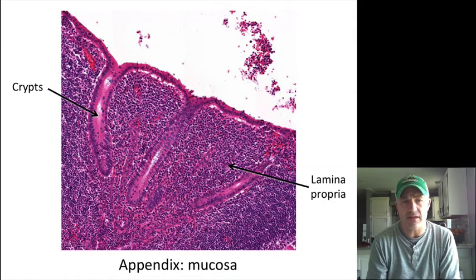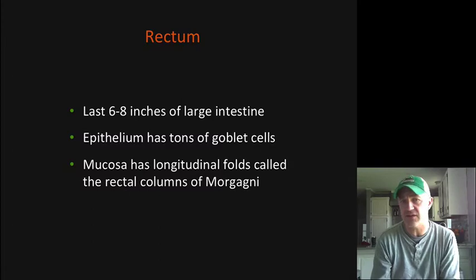Other than that, not much going on with it. You can see there's some crypts and other stuff in it. I'm probably not going to take a look at it.